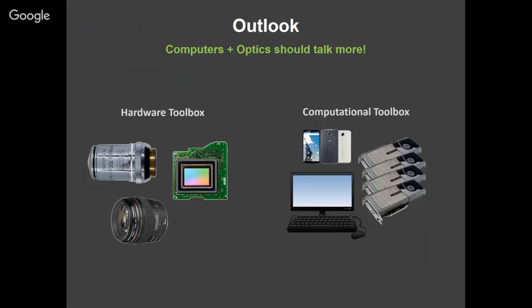So you can prototype these things really quickly. And we do a lot of work trying to make sure everything that we build is easily replicable. This is the open source idea of putting the code online, but also making the hardware simple and easy so that somebody can build this thing themselves cheaply and without putting in a lot of time. So we typically also open source our hardware designs. We haven't done this yet for this project, but we will.